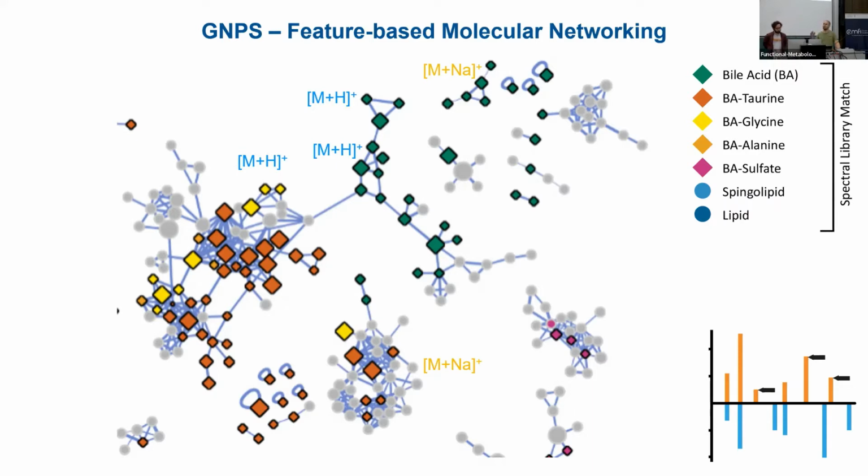So for now, what we look at today is only based on MS2. There is another step of establishing connectivity between the nodes, and that is based on the peak profiles. So that's a tool Robin and I developed called ion identity molecular networking that actually does a feature correlation analysis between basically co-eluting compounds, and if they have a very good matching shape, and if the mass delta fits to some user defined values, you will also establish additional connectivity.